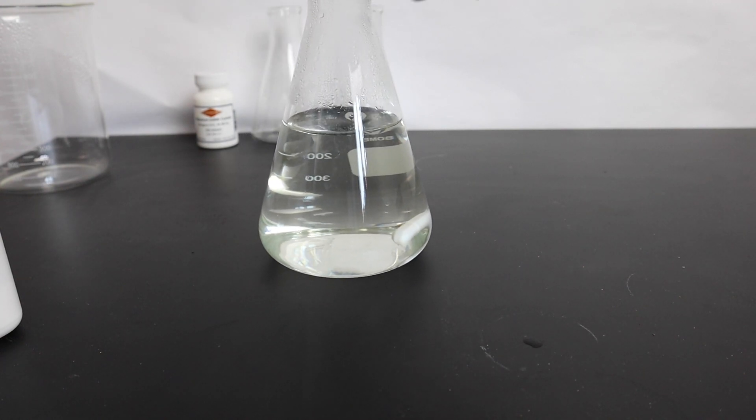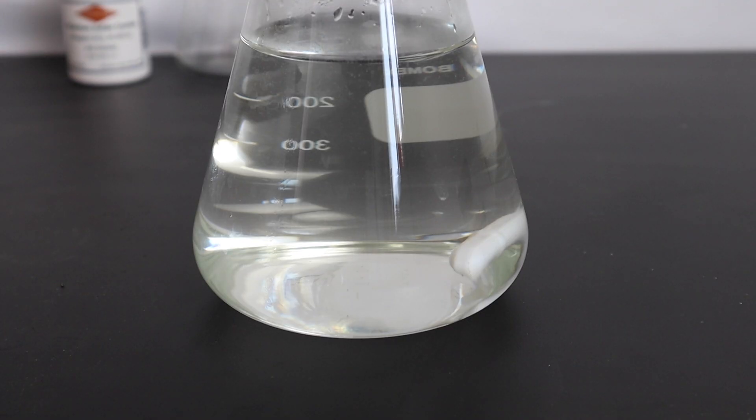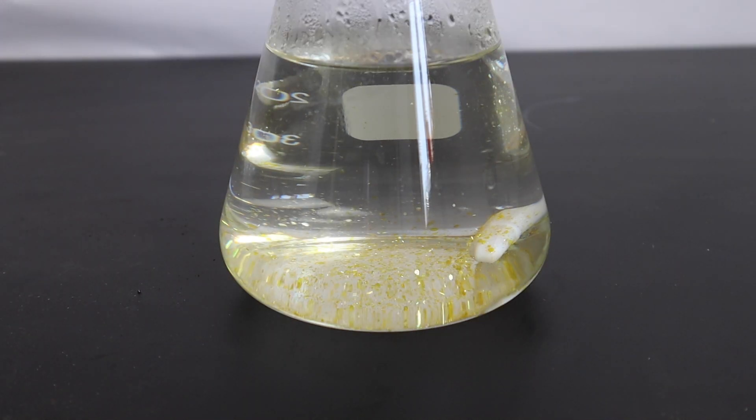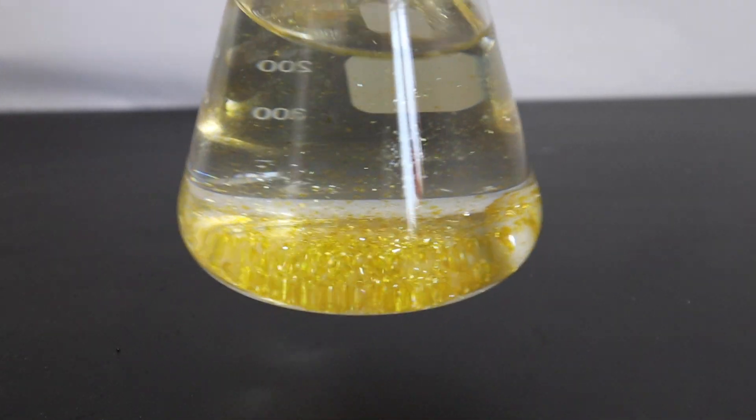I mixed the two hot solutions and waited. After a few minutes, little golden flakes of lead iodide started appearing. After about 10 minutes, I gave it a shake and that was a good idea.